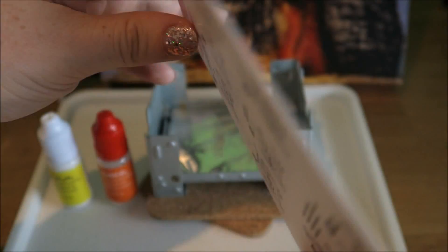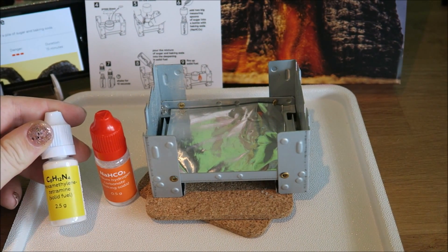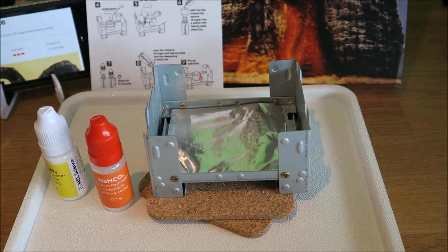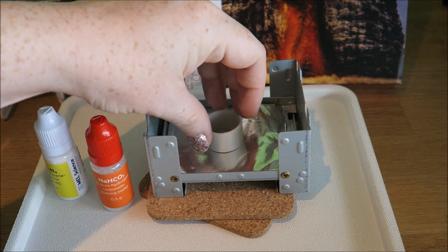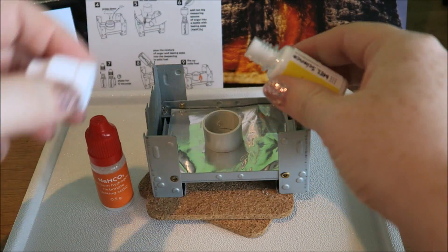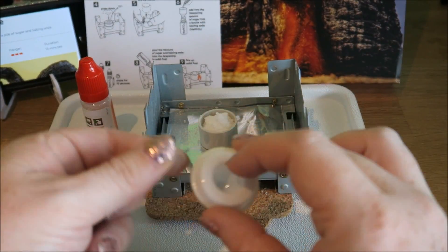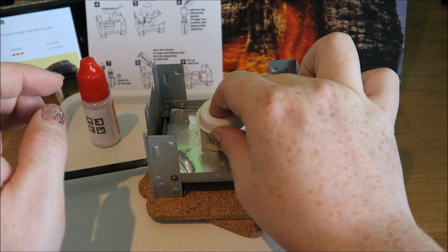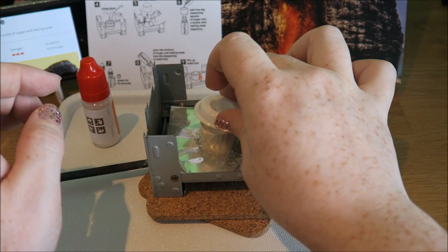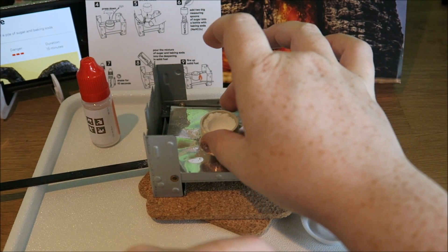Our sugar snake. For this we have hexamethylenetetramine, which is our solid fuel, and we have sodium hydrogen carbonate, which is baking soda. You need some sugar. Have a little mold, pop that on there, and the solid fuel all goes in there. And then we use this little tool to make a mold. Push that down, tap, lift, then I'm going to take this bit off as well.